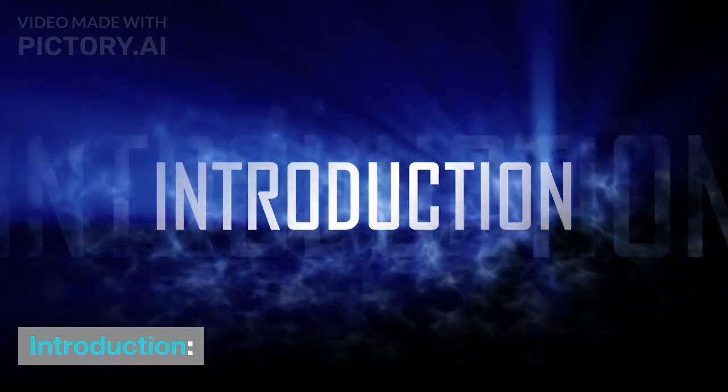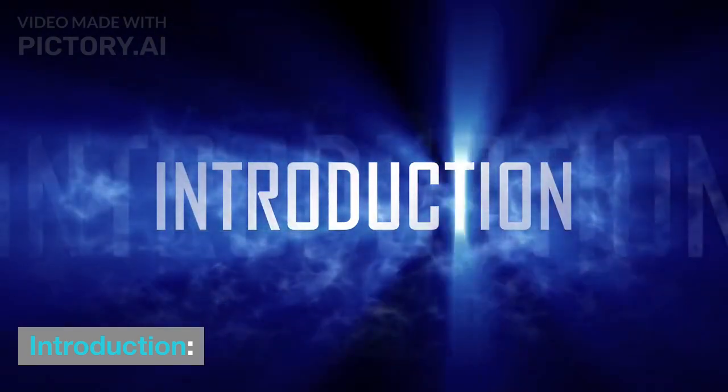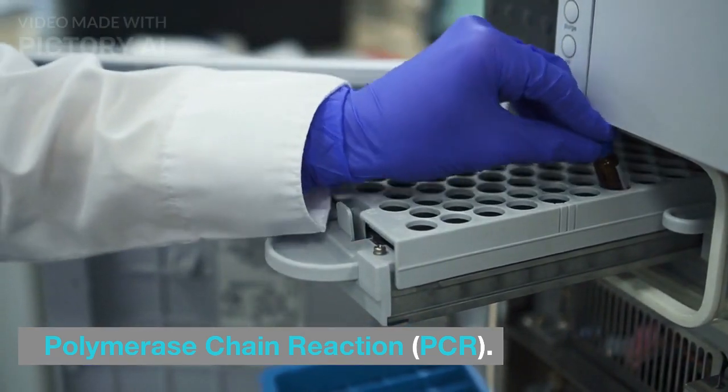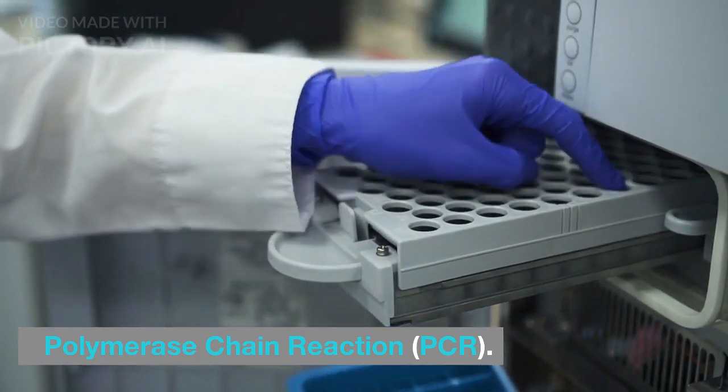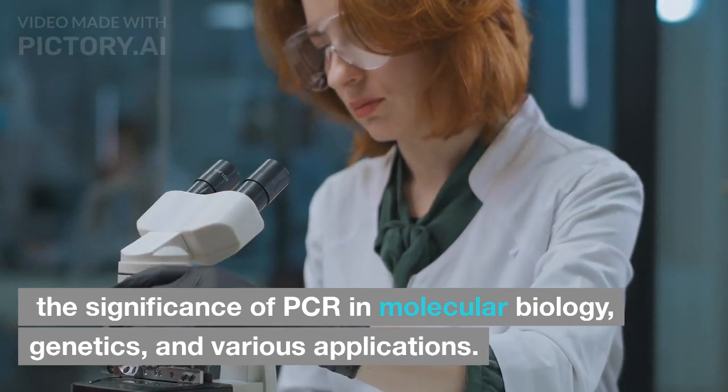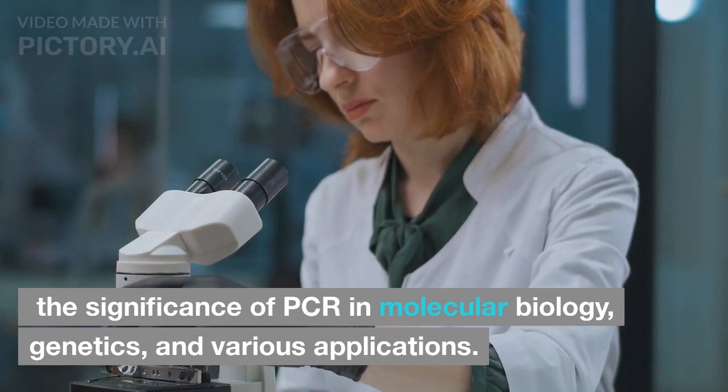Introduction. Polymerase chain reaction, PCR. The significance of PCR in molecular biology, genetics, and various applications.